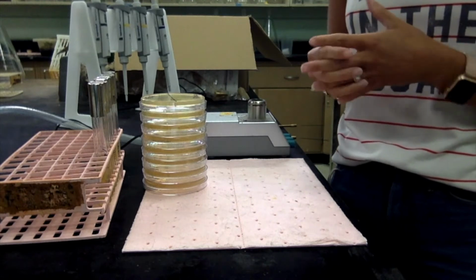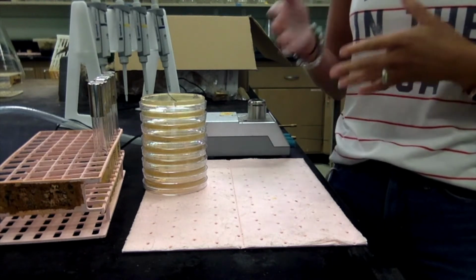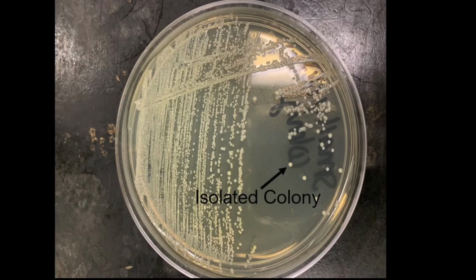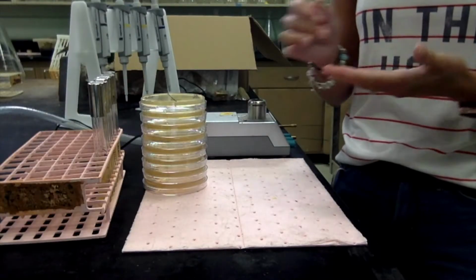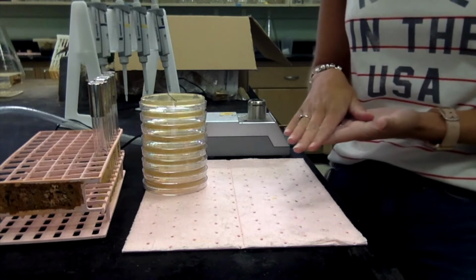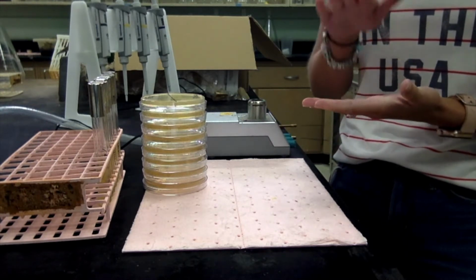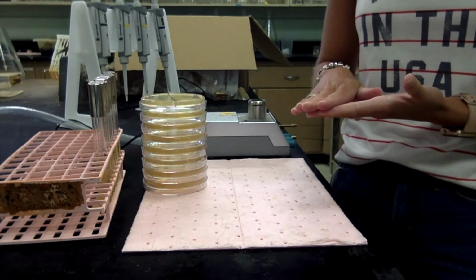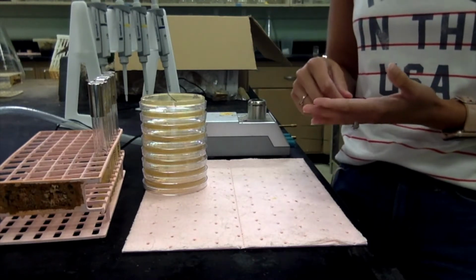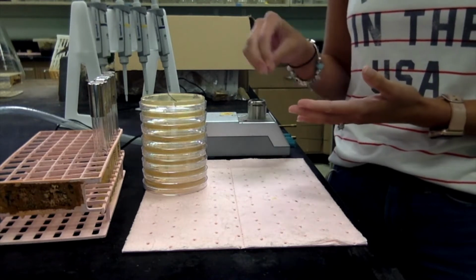So we do a streak plate whenever we have a sample of bacteria and we want to get what is called an isolated colony. If you remember that PCA plate from the very first video of microorganisms in the environment, where we had several different kinds of colonies and several different kinds of bacteria on one plate, that's what we want to not do on the streak plate. So basically we would take one of those colonies and then do a streak plate with it. That way we could get a pure sample.